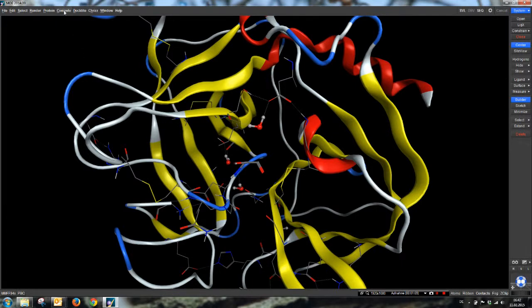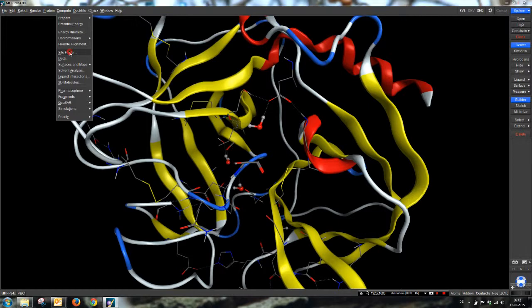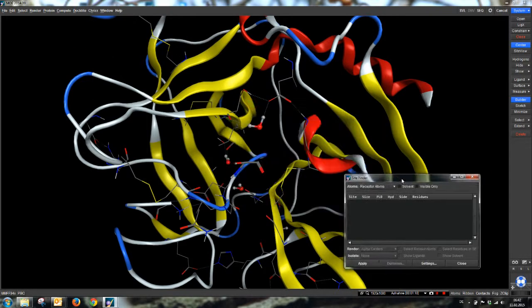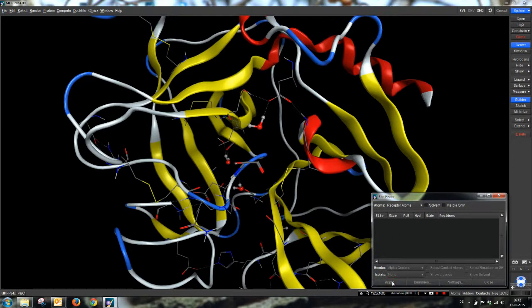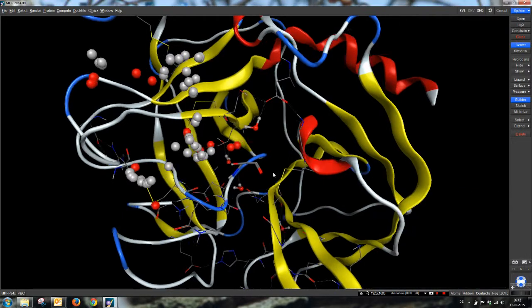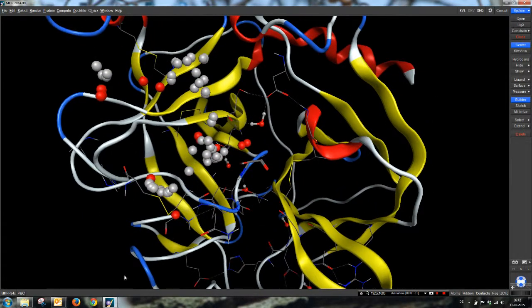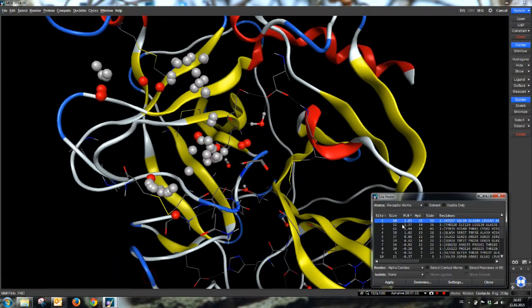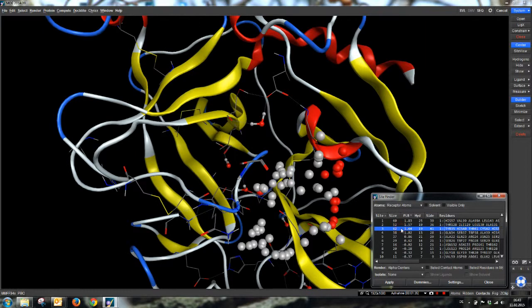For this purpose, we go on compute and open the SiteFinder application. We can just use the default values and click on apply. We see the first site is just around the serine residue. This looks very nice. The second one is far away. We can skip this.